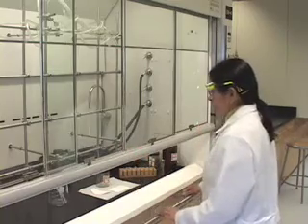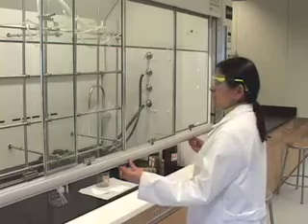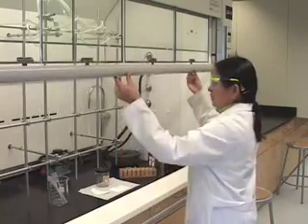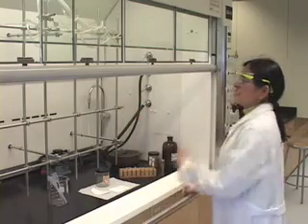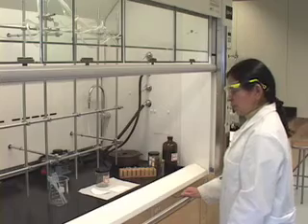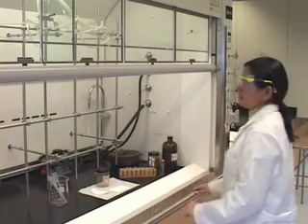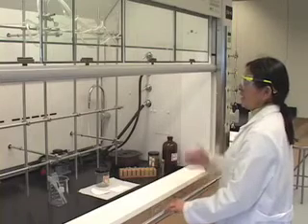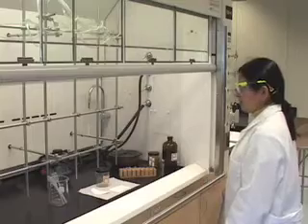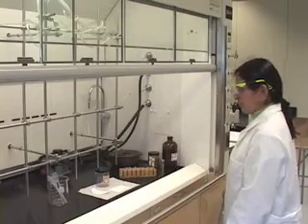For our video recording purposes of the demonstration, we will be working with our hoods raised all the way, just so that the reflection of the glass doesn't interfere with our recording. So please note that this is not the correct way to be working in the hood, but we have the hood sashes raised only so that the glass reflection does not interfere with our recording.